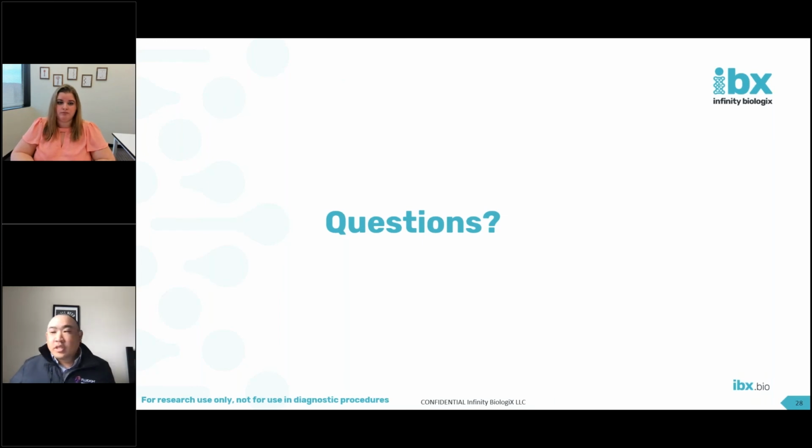So we have a few questions here for you, Jess. The first one, what is the typical turnaround time to develop and optimize an assay panel at IBX? About 6 to 8 weeks. Okay, great. And that goes through the entire workflow from development and troubleshooting and also identifying your controls? Identifying your controls and everything are things you can begin during the development process, as I usually use some of the controls during development. However, development can take a little longer. It just depends on if your assays work the first time, if you have to order additional assays, because that can push you back depending on how long it takes to receive your new custom assays.